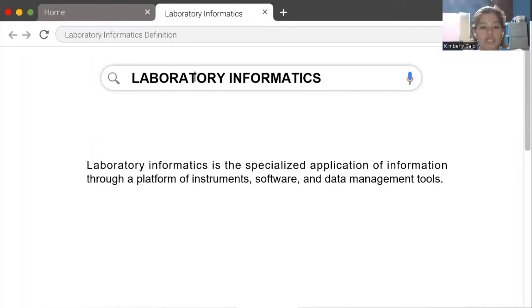A scientific data is information based on research carried out by scientists to capture, process, migrate, and interpret for immediate use. It is also stored, managed, and of course, shared to support future research, development, and lab testing efforts while also maximizing efficiency of laboratory informations.